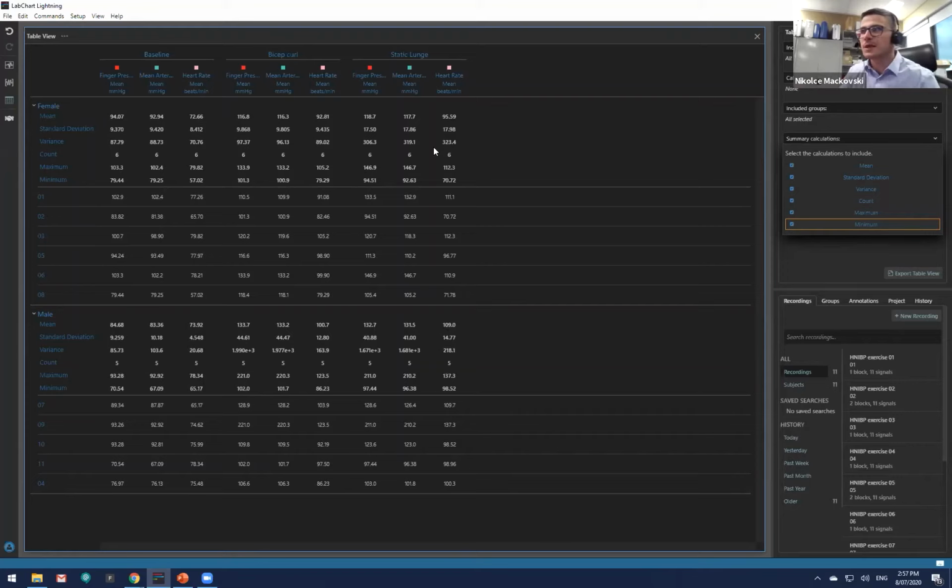This does take a bit longer in DataPad, but you can see how quickly you can do this. And this will actually keep updating the more data you put in there. It is tricky to do this in DataPad because when you add some more data, then you have to modify the calculation. Same thing with Excel. Here, it's just doing it for you instantaneously. So that's a really handy way to look at your data really quickly and to provide analysis.